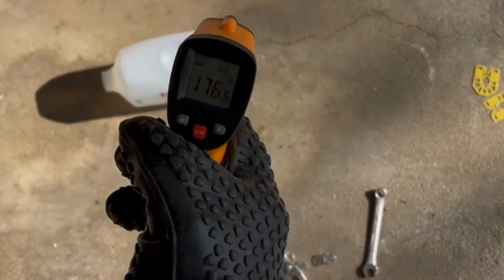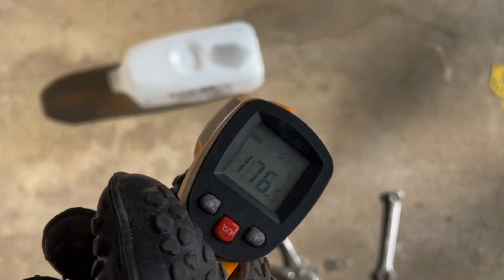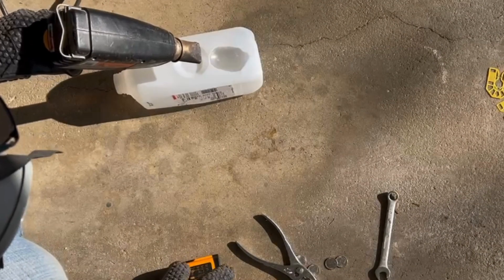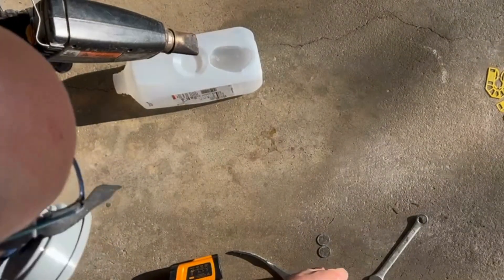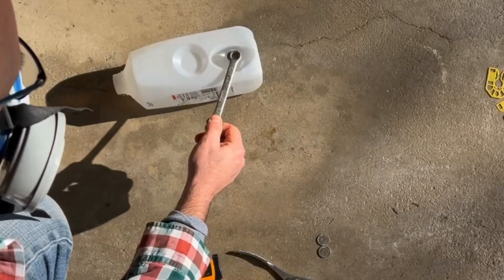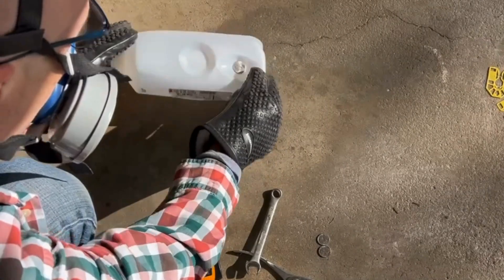Here we can see that the surface temperature of the plastic has reached 176 degrees Fahrenheit. The video will be sped up and the background audio dropped out. Here I place a nickel on the melted plastic and push into it to see if I can get it to form to the shape of the nickel.